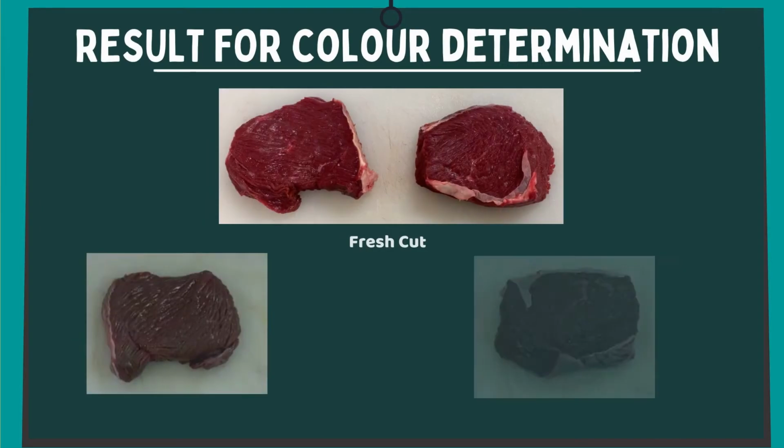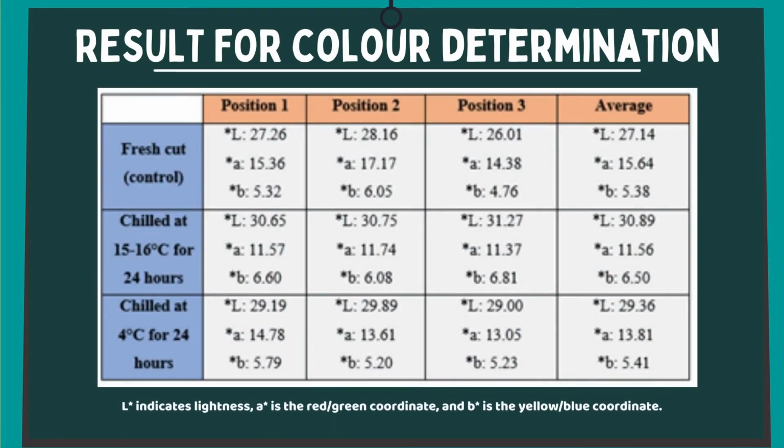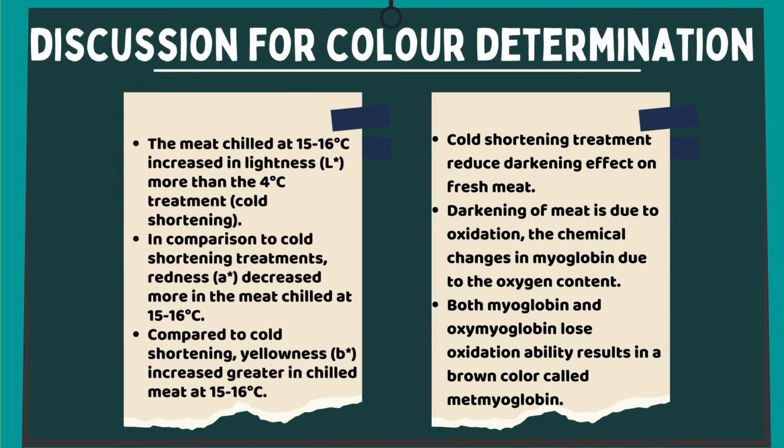Here are the color changes before and after the treatment. Next is the table showing the reading of the colorimeter for both meat conditions. For the discussion of color determination, the cold shortening treatment reduced the darkening effect on fresh meat. Darkening of meat is due to oxidation, the chemical changes in myoglobin due to the oxygen content. Both myoglobin and oxymyoglobin lose oxidation ability, resulting in a brown color called metmyoglobin.